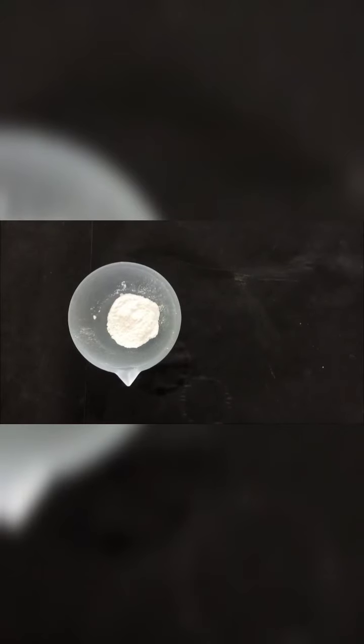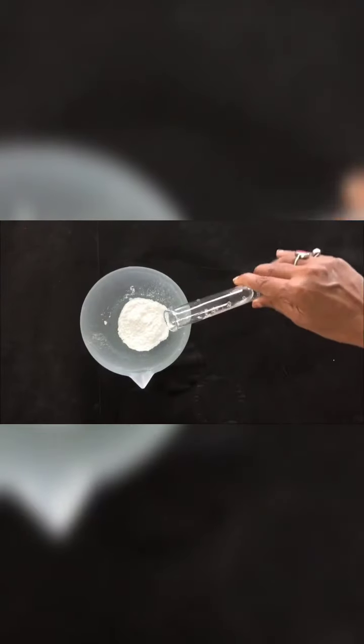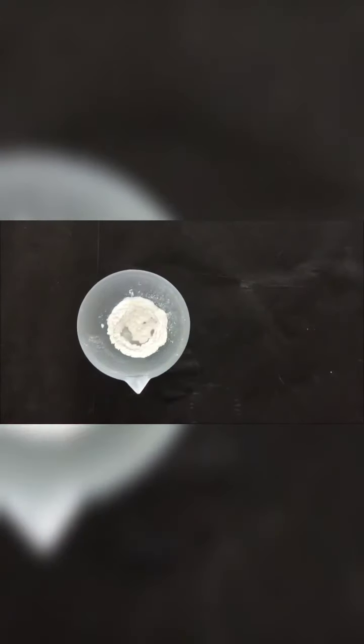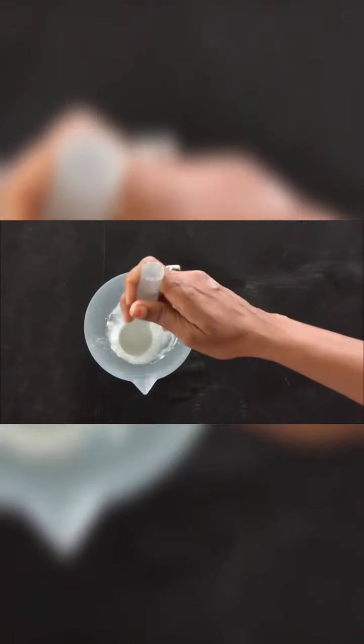For the preparation of TLC plates, first we have to prepare slurry of silica gel G by mixing 1 part of the silica gel G with 2.5 parts of distilled water. It means if you have taken 1 gram of silica gel G, then mix it with 2.5 ml of distilled water to prepare slurry. Here we have taken 5 gram of silica gel G into the glass mortar and pestle and then add about 12.5 ml of distilled water and then mix it with the pestle to prepare slurry.